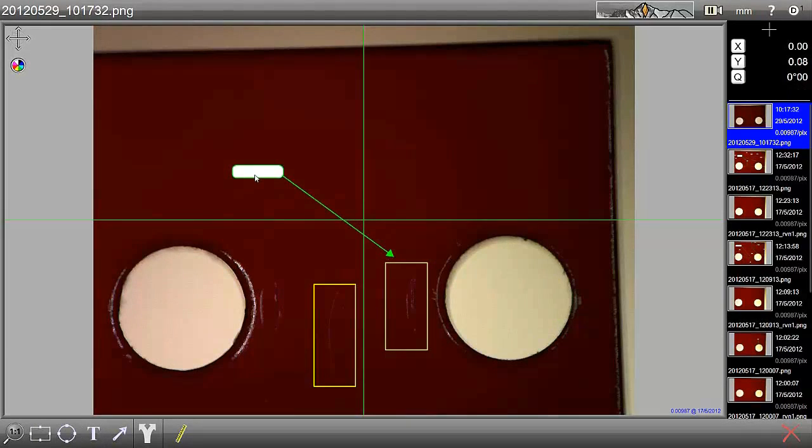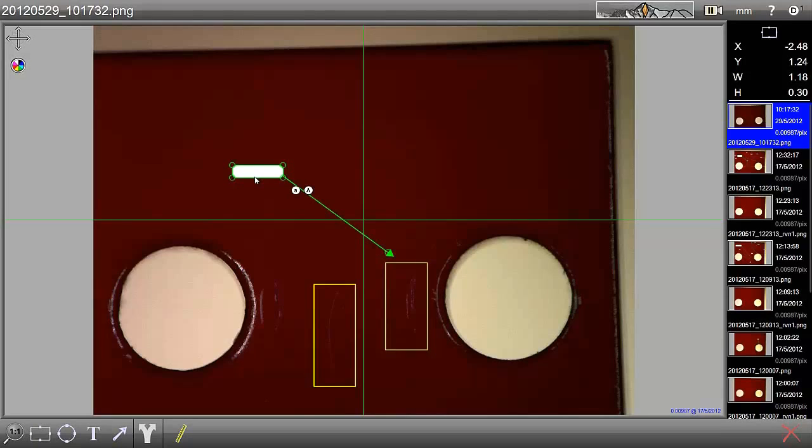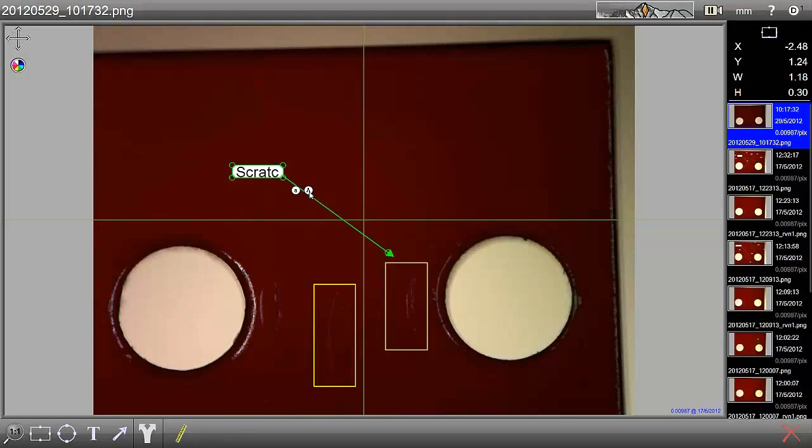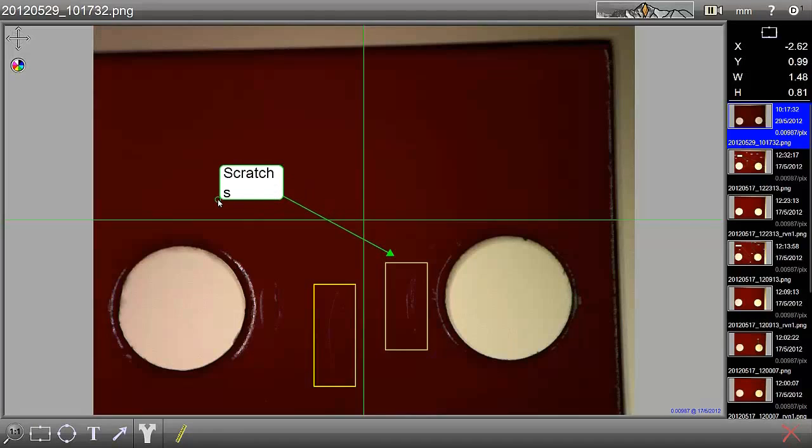We will draw an outline here, select the box and then enter whatever the problem is. In this case, it's scratches. We can then make this text bigger by using the button here. And we can make the box bigger by stretching it using the mark here.